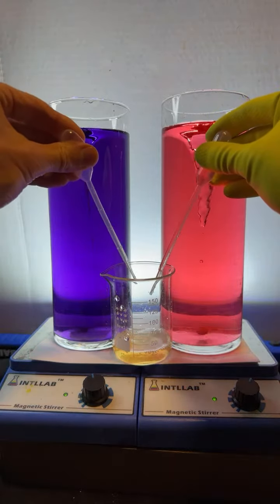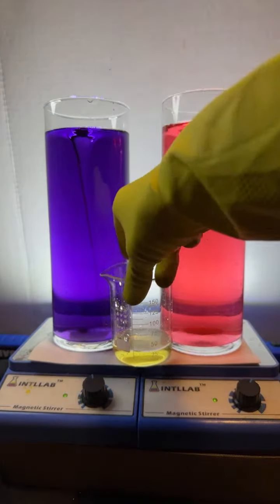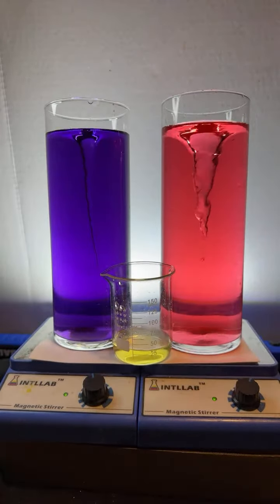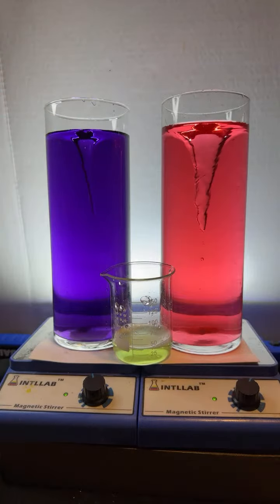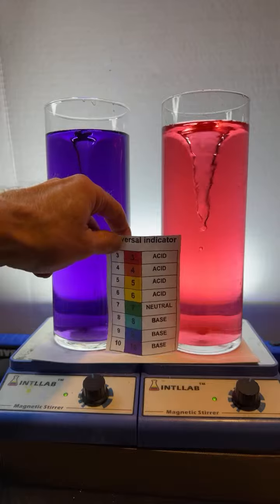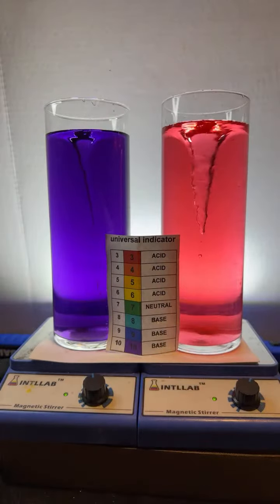What's the difference between a strong acid and a weak one? Well, let me just do the experiment here. There we go. Looks like we got yellow, yellow, green. So what these two do when you mix them together, if I get balanced amounts, another squirt of that, I'm trying to add a little bit more base. So if you add equal amounts of acid and base, they neutralize each other. So I added the pH 3 and the pH 10, and when you add them up in the right amount, you get neutral because acids and bases neutralize each other. It did look like that for a bit.